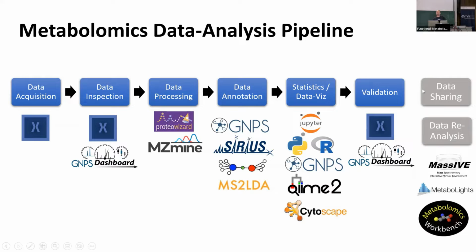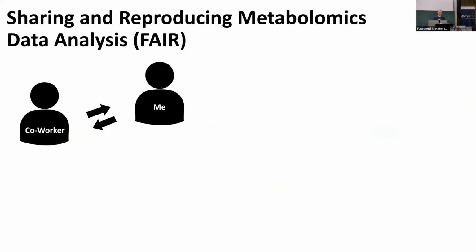And then at the end here, this toolbox is data sharing and data reanalysis. I think this is becoming more and more important. We could also bring that to the beginning already, because depending on the lab and the policies, people make the data public right away. And for us, especially being a collaborative group, that really facilitates the interaction with everybody. To me, working with a coworker, say in San Diego with Allegra, if I have to move gigabytes and gigabytes of data each time, it's really hard.